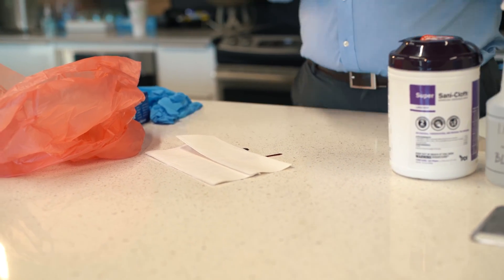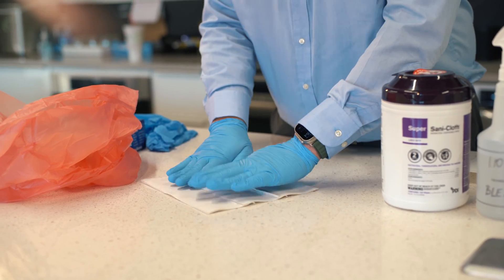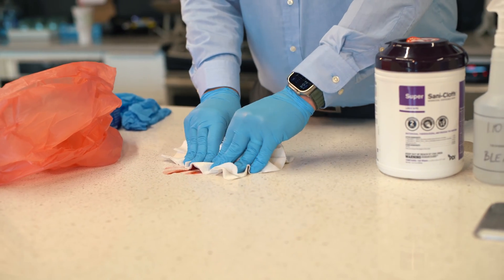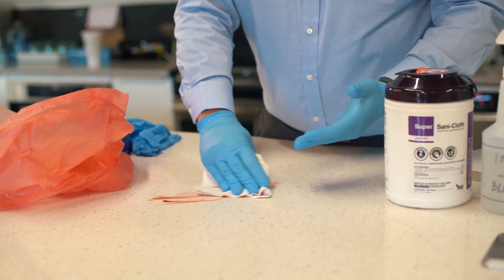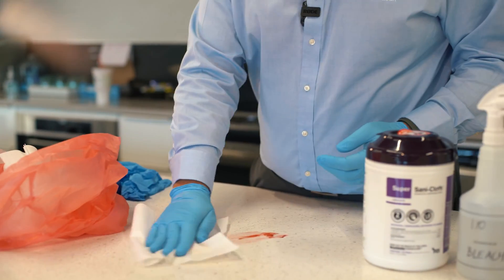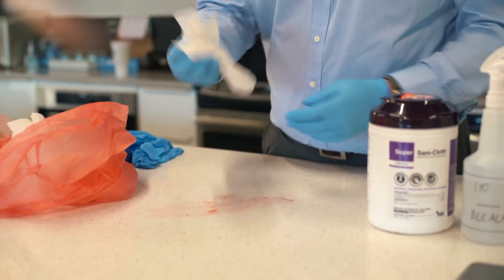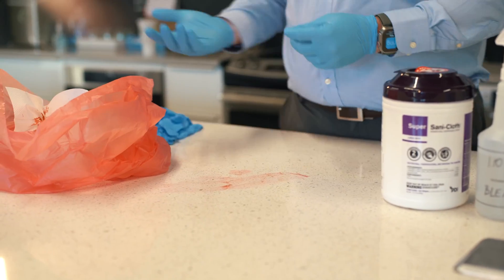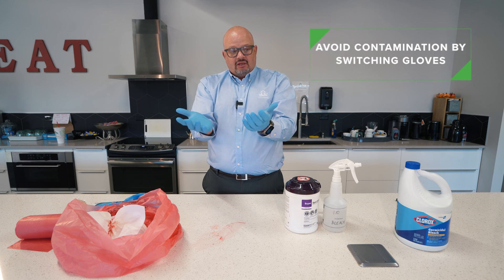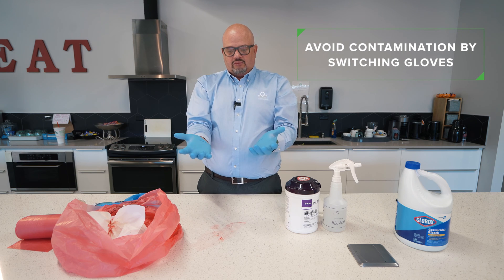With my gloves on, I'm going to use paper towels to soak up as much of the blood as possible. Then I'm going to take these gloves off — I don't want to grab the clean disinfectant bottle with possible contamination on my hands.